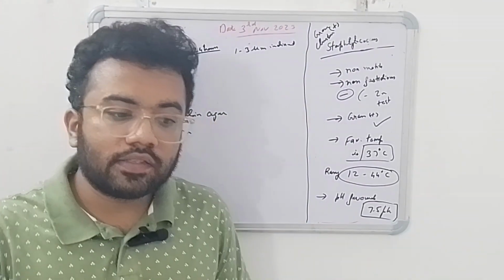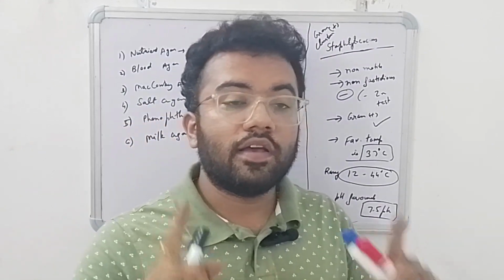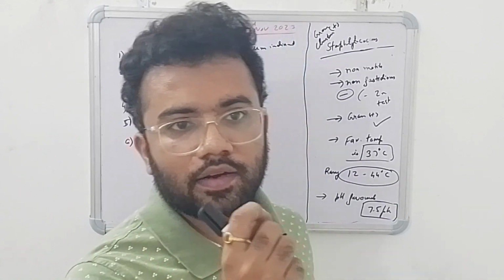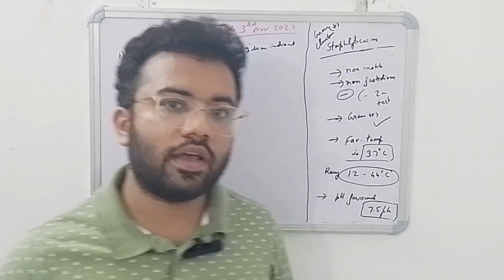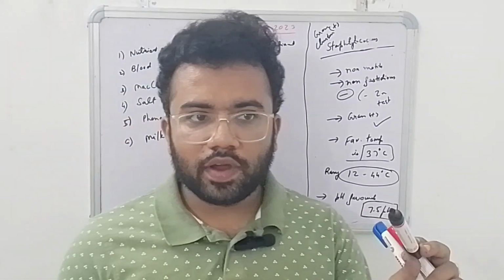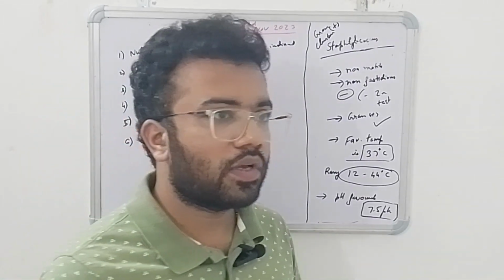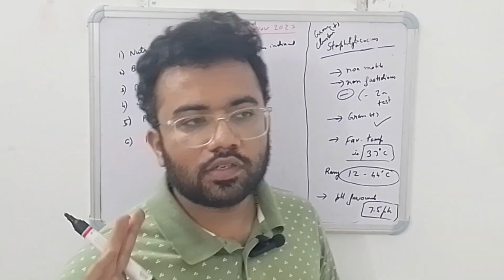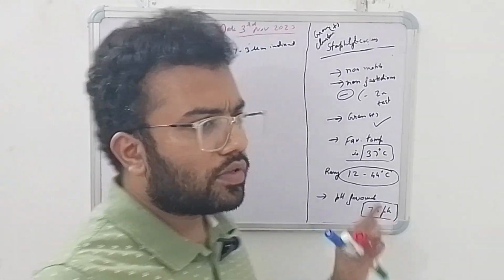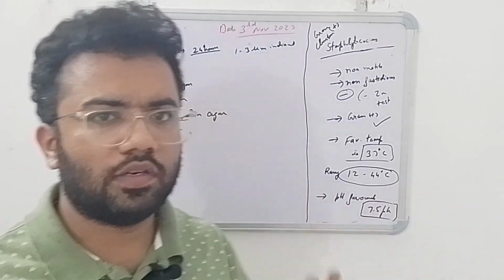And there is another condition in which the pigmentation enhancement is more, that is the presence of more fat. If there is more fat, there will be a lipolytic reaction and you will see more pigmentation. So the presence of more fat can also be one cause for the enhancement of the pigmentation. So please remember that aerobic condition is very favorable for more pigmentation enhancement. And as we know, this bacteria works in both aerobic and anaerobic condition.